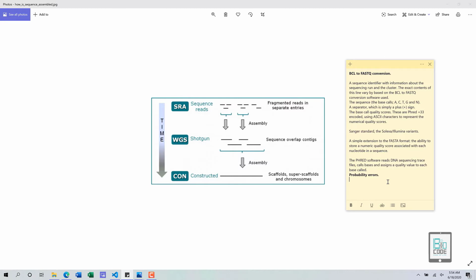So that we can understand that these regions of the genome are not as accurate as they should have been, and then scientists rerun their genomic sequencing so that they can find the accurate regions. In most cases when we are doing genomic sequencing, we find regions that are not as accurate as we hypothesized, because there are so many errors within sequencing technologies, and it is not perfect yet.